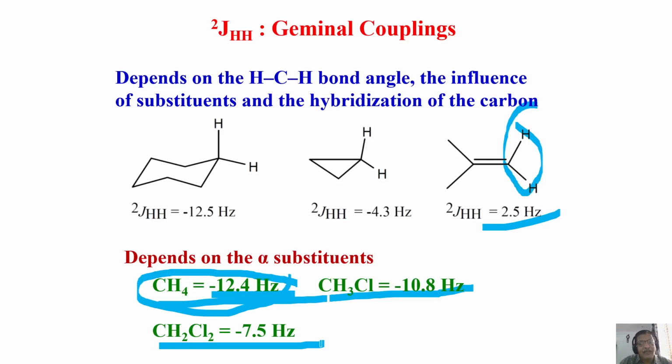information, homonuclear and heteronuclear. Then we'll really get into complex spectra and analyze them together.